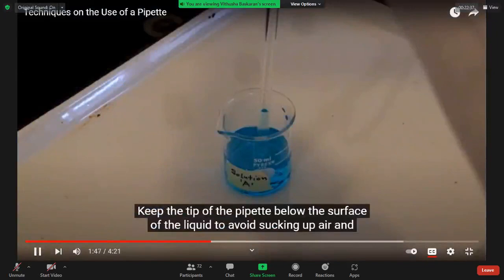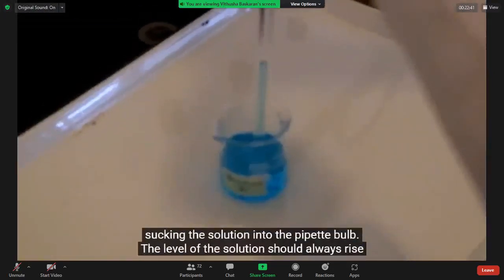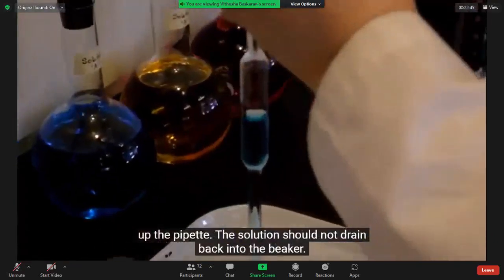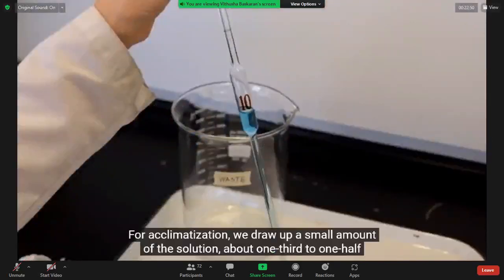Keep the tip of the pipette below the surface of the liquid to avoid sucking up air and sucking the solution into the pipette bulb. The level of the solution should always rise up the pipette. The solution should not drain back into the beaker.